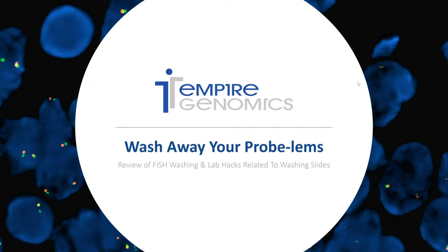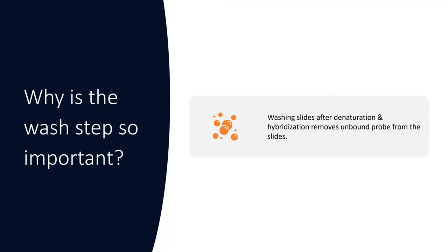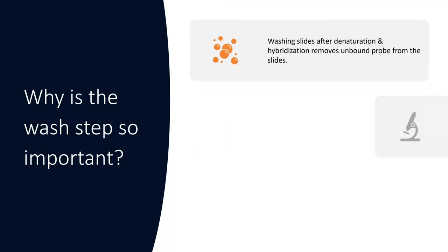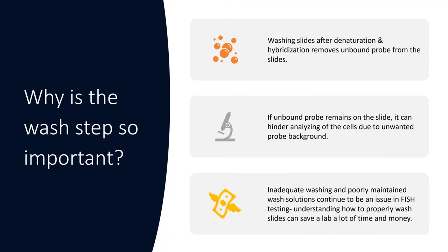So why is the wash step so important? I still get so many labs having difficulty with cell background and washing, and I get a lot of questions about how to wash properly and what solutions are best. Washing slides after denaturation and hybridization removes unbound probe from the slides. If unbound probe remains, it can hinder cell analysis due to unwanted probe background. Inadequate washing and poorly maintained wash solutions continue to be an issue in FISH testing, and understanding how to properly wash slides can save a lab a lot of time and money.